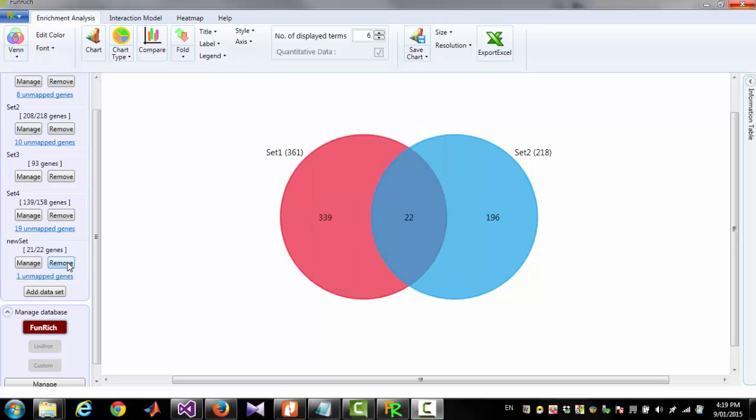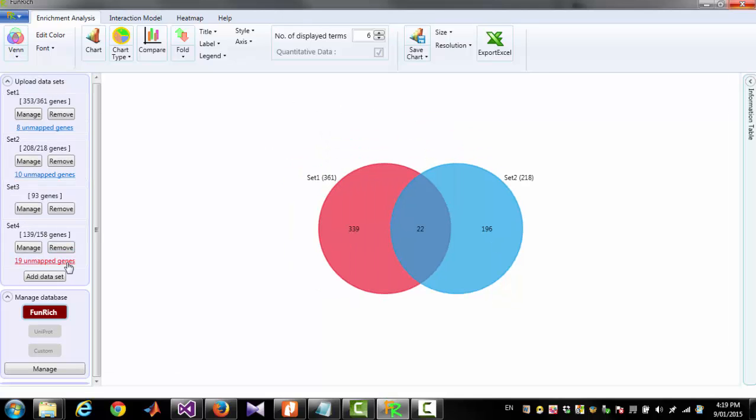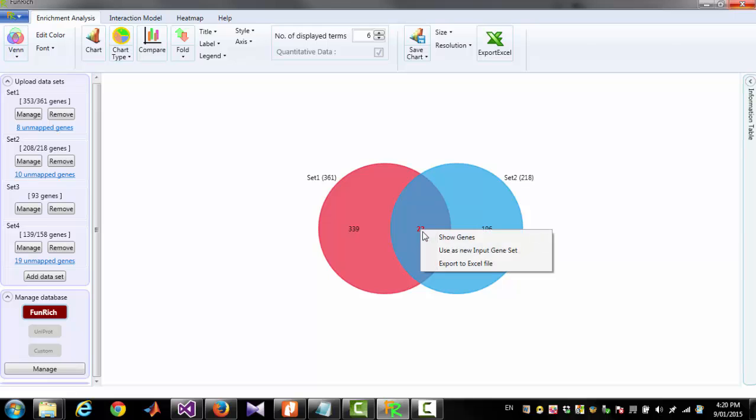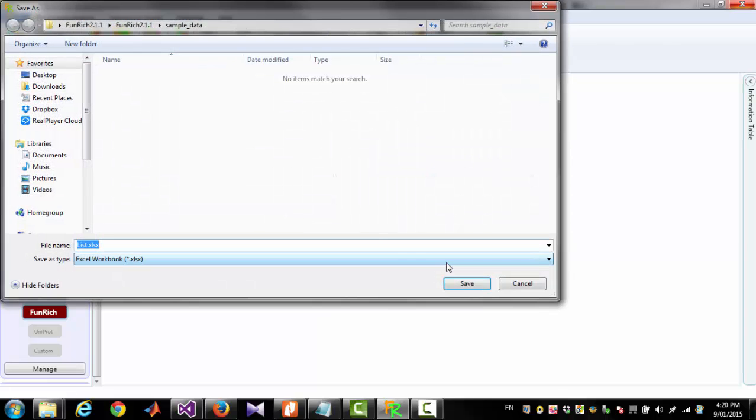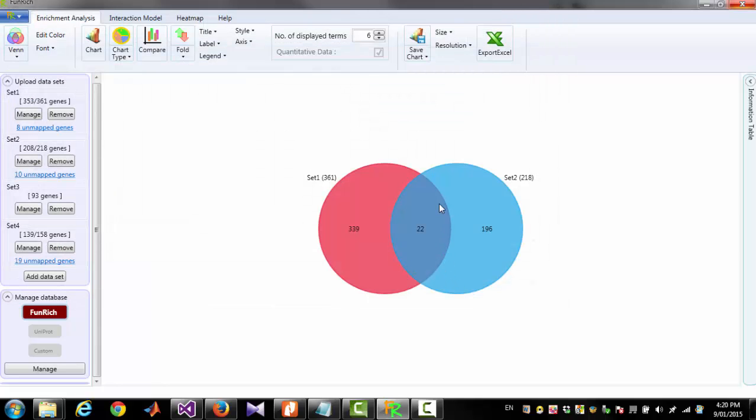For now I am removing this new set. You can also export this list by clicking Export to Excel file. You should give a name for the excel file and click Save.